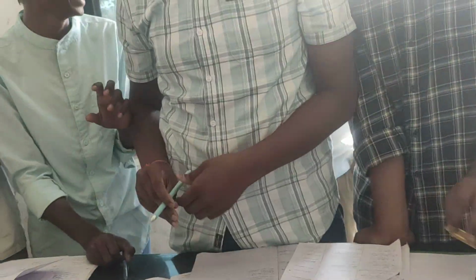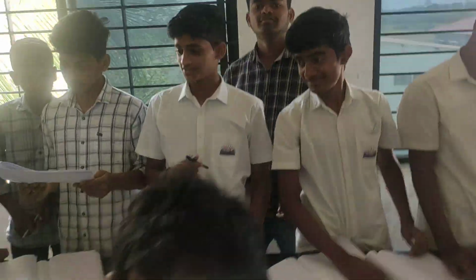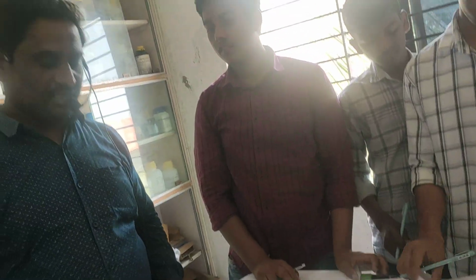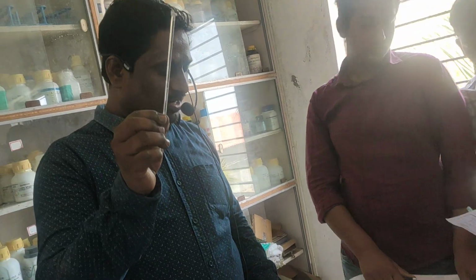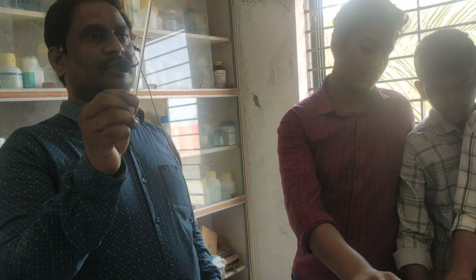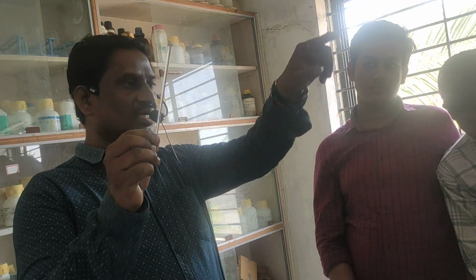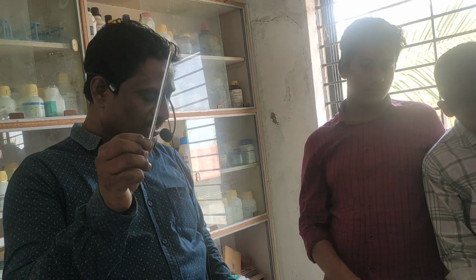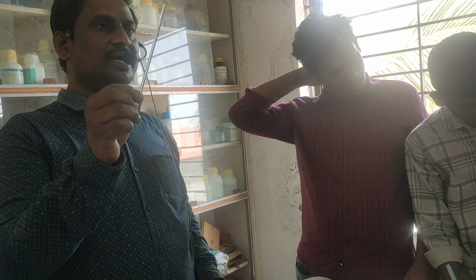Confirmation test for Ca plus 2. Salt plus 1 drop of concentrated HCl. Make a paste and hold it in the flame by glass rod.